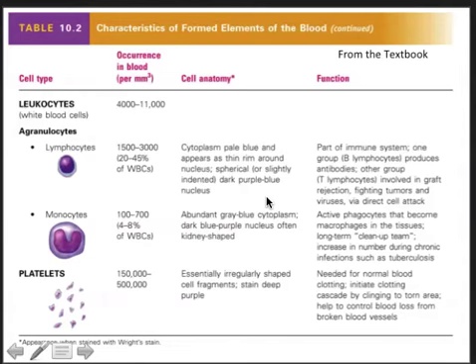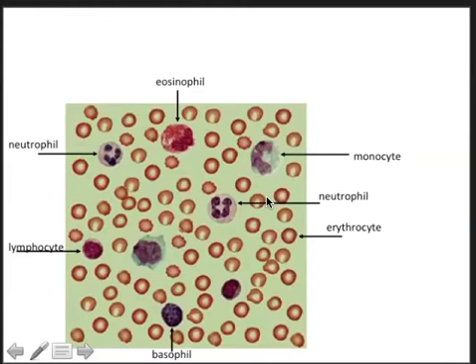Okay, so this is an actual blood smear. This is some practice. What you can see here, of course, are the erythrocytes. Right, those are very easy to pick out, the red blood cells. The lymphocytes are going to have these very large oval to round nucleus and very little cytoplasm. You can see here the neutrophils, okay, which have these unusual looking purple staining nuclei with many different lobes and these pink staining granules. And you can see here a monocyte.